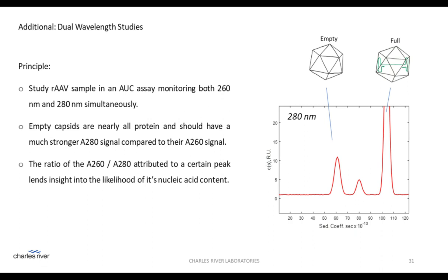However, as is well known, at longer wavelengths we have some difference between the absorbance properties of proteins versus nucleic acids. That is to say, aromatic protein side chains clearly have an absorbance peak around 280 nanometers, while nucleic acids show a much stronger signal lower, at 260 nanometers.